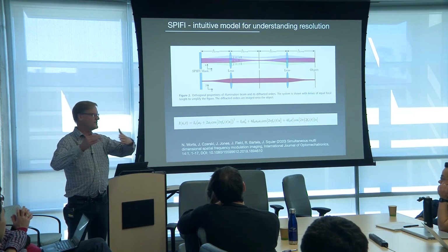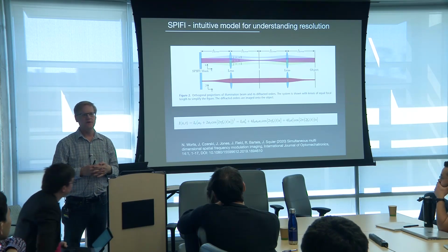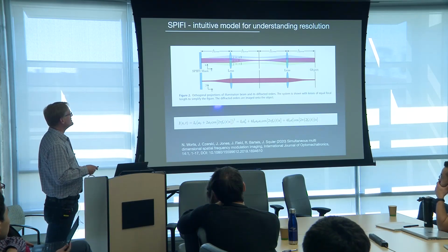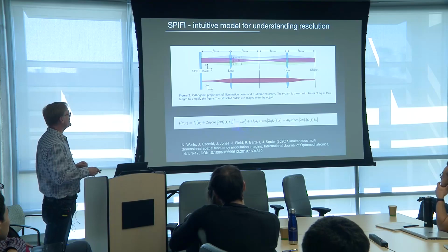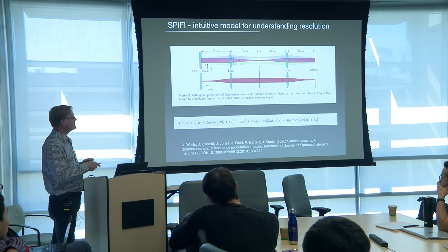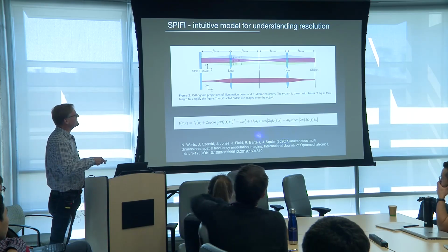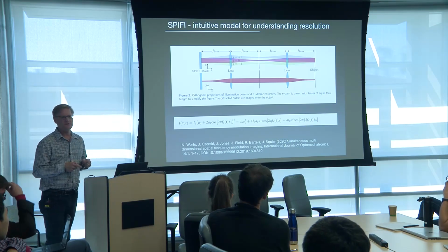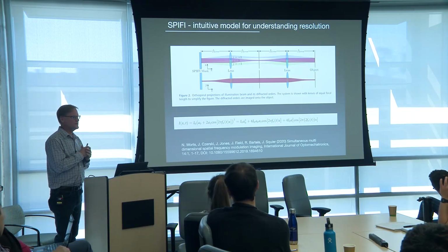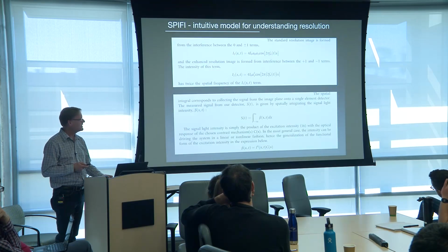That's the name of the game. Hopefully you agree that if I could just see an image formed by the light sheets that just travel through the edge of the beam, I'm always projecting higher spatial frequency content. Here I'm showing as little math as I can, but this is the actual expression for the intensity profile at the image plane. And look, there is a term with higher spatial frequencies. You're doing spatial frequency projection, modulating the image as a function of time. That's why it changes as a function of time.